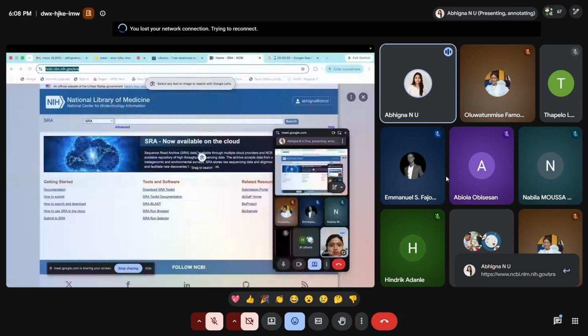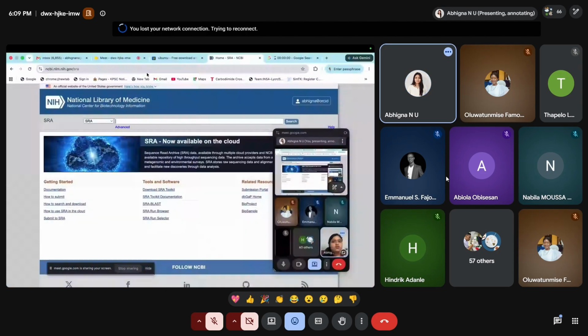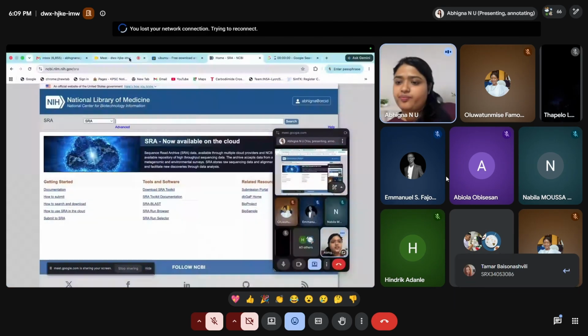Okay, I have shared the website. Please go to the SRA website here, type in your favorite bacteria and give me your top hit in the chat box.